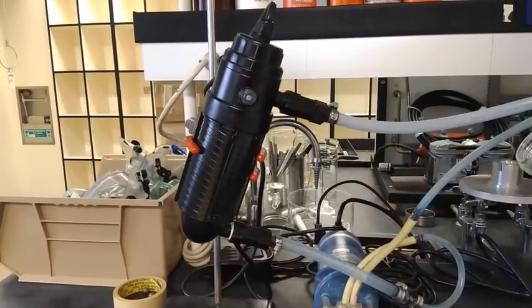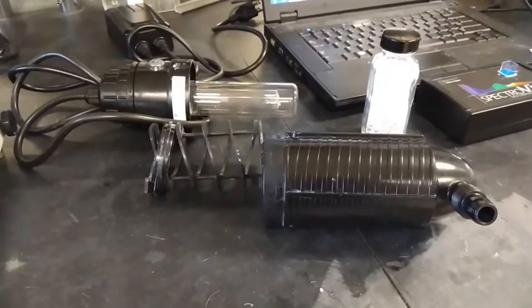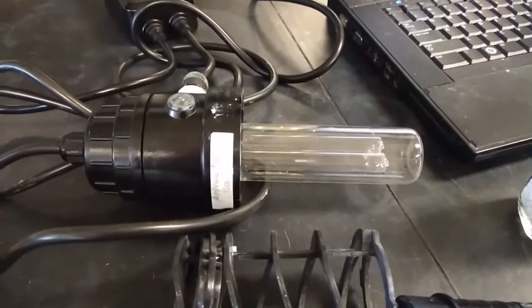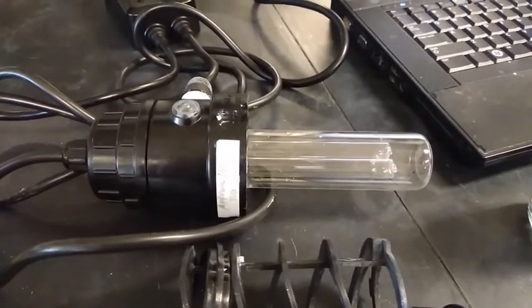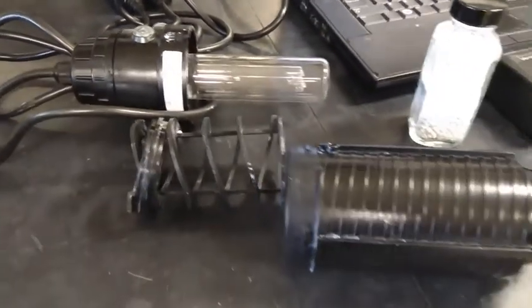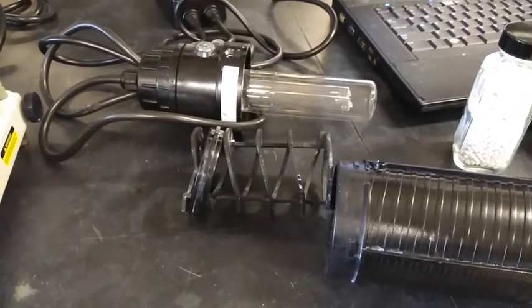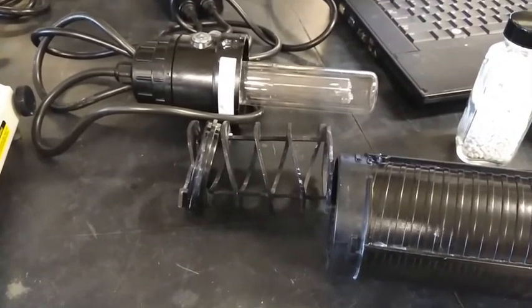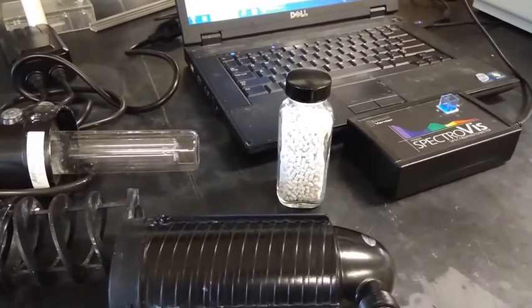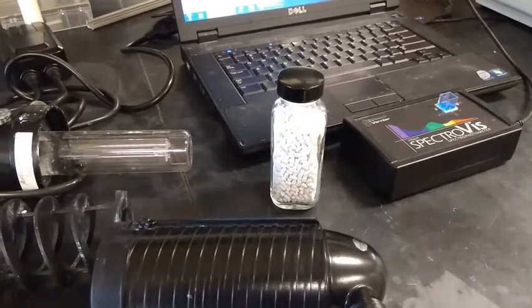Up here is the actual photocatalytic reactor. I've opened one up to show you what's inside. Inside that clear glass tube, you can see something that looks like a pretty strange looking light bulb — that's the UV light bulb. You can see the housing, and then a spiral right next to it. That spiral makes sure that the solution comes in good contact with the UV light during the reaction.